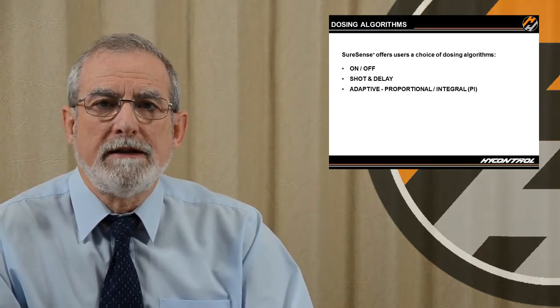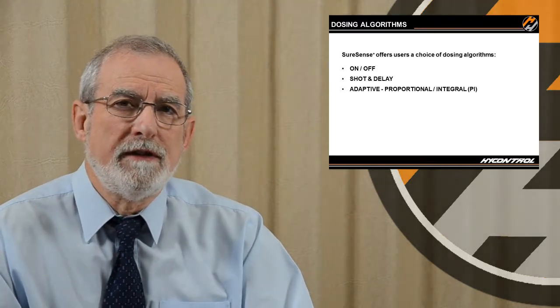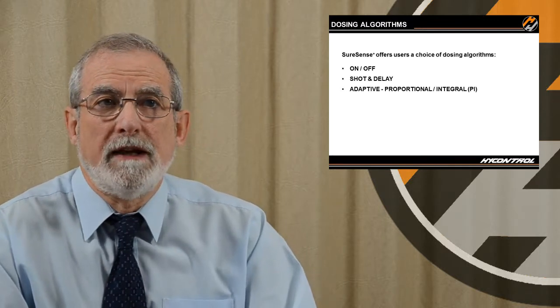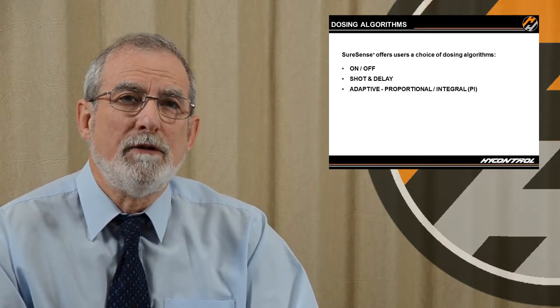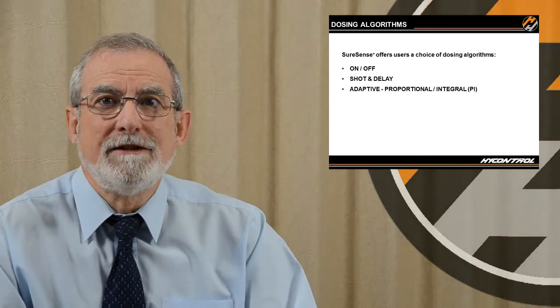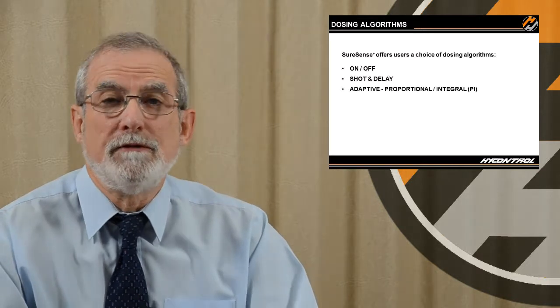The useful thing about this is it can control foam at a fixed level in a vessel. And in some processes that's very useful to do. It also means that it reduces the antifoam addition to the very minimum. So in effect, it can arrange for the antifoam addition to just balance out the creation of foam, and it will do that automatically.